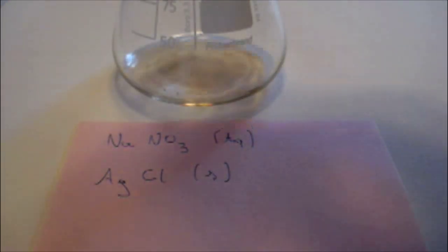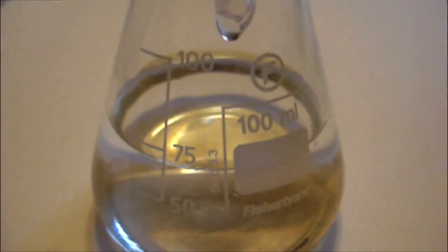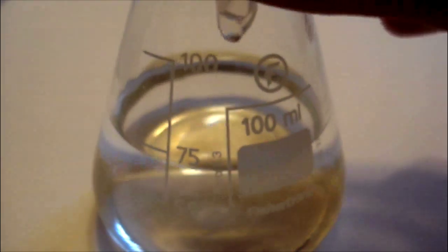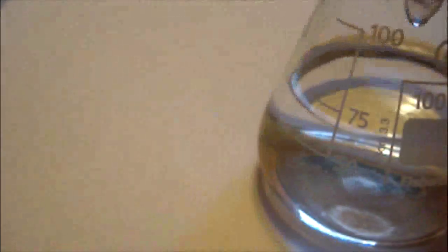You have to filter the solution to get the silver chloride and the sodium nitrate solution. Here is the sodium nitrate solution, which is about 75 milliliters.